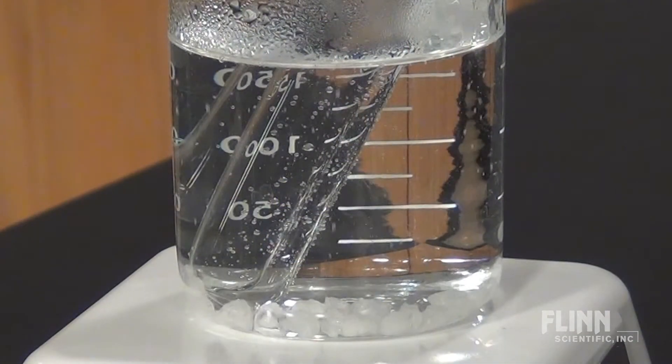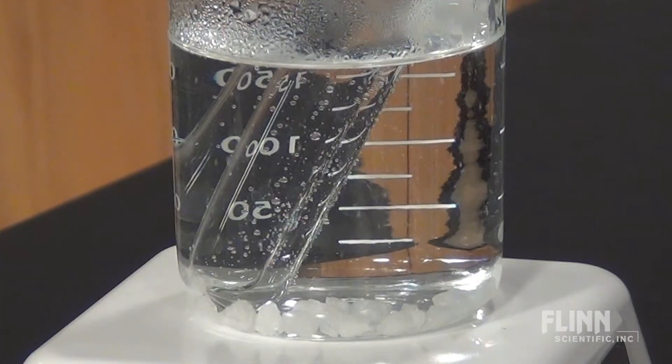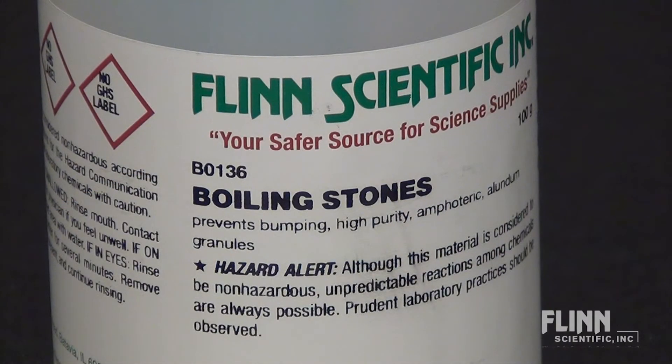Make sure to use borosilicate glassware, which is meant to stand up to high temperatures. Flint or soft glass is not and could shatter. You should also use a few boiling stones. These help to keep the beaker from knocking, which could tip the beaker over.